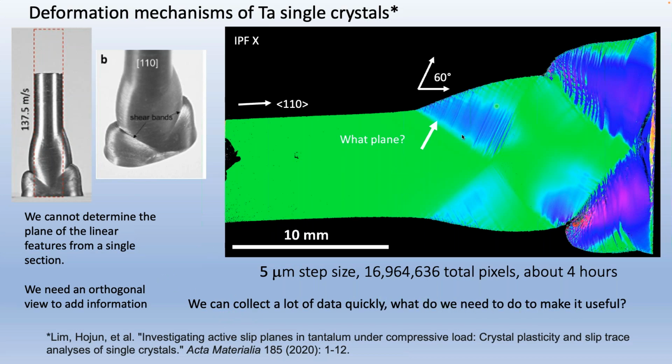In here, we were interested in what these slip bands were, what the crystallographic nature of these were, among some other things within this sample, the shear banding and everything else that's going on in here.